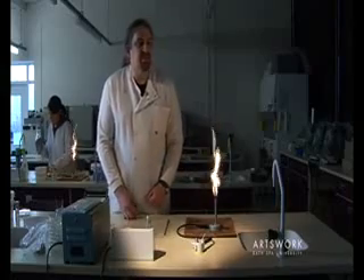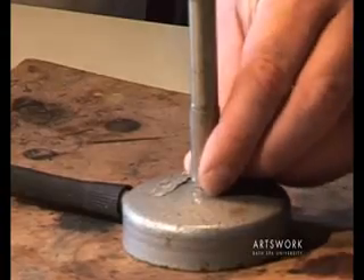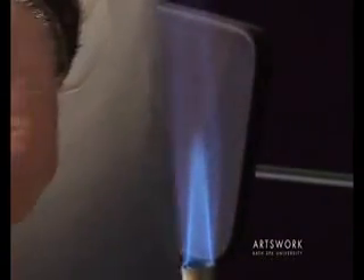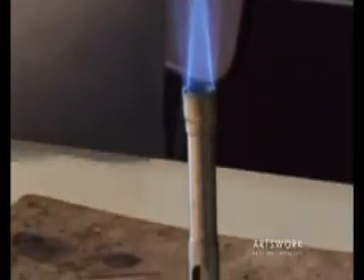When we want to use the Bunsen for sterilising equipment, if you turn the metal collar at the base, you can see it's opened up the air hole for a much higher rate of airflow, resulting in this much hotter but blue, almost invisible flame.